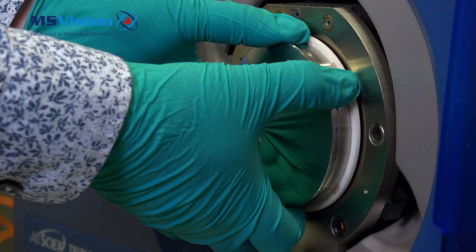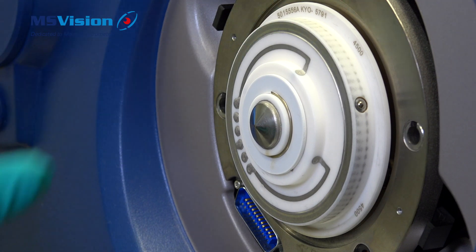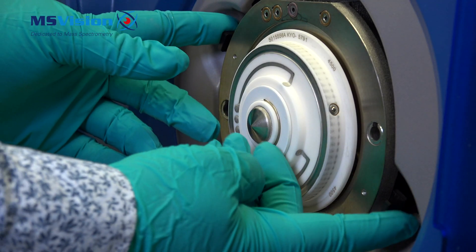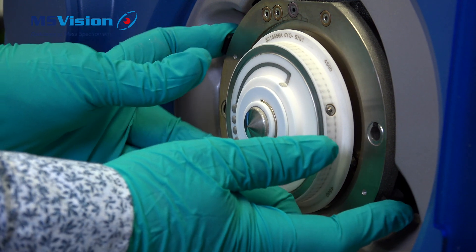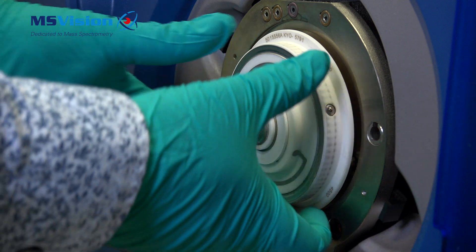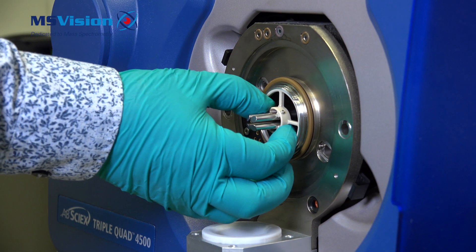Take the curtain plate and gently pull away from the system and twist if needed. Take care as the plate may still be hot. Remove the orifice plate by pressing in the two black push-in locking pins located as shown. The orifice plate will move out a little — carefully pull it away. Use caution as the orifice plate may still be hot and it is very fragile.